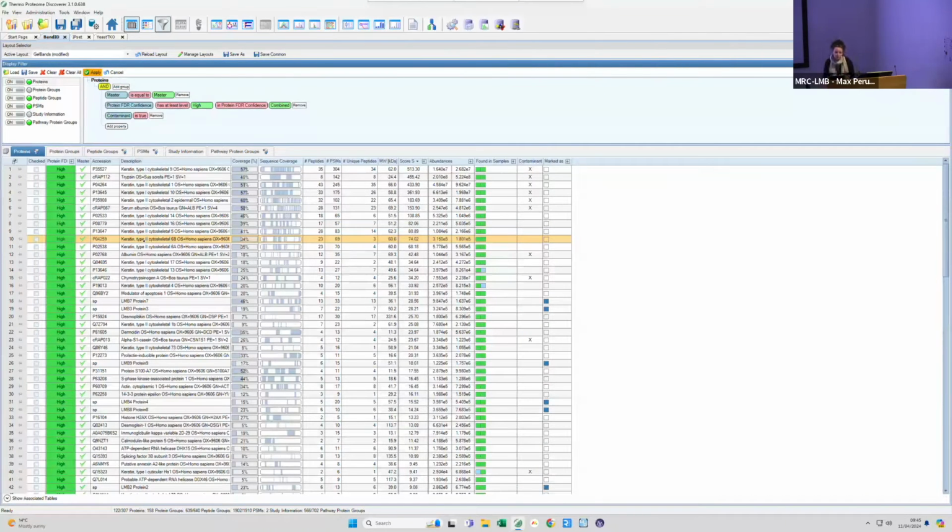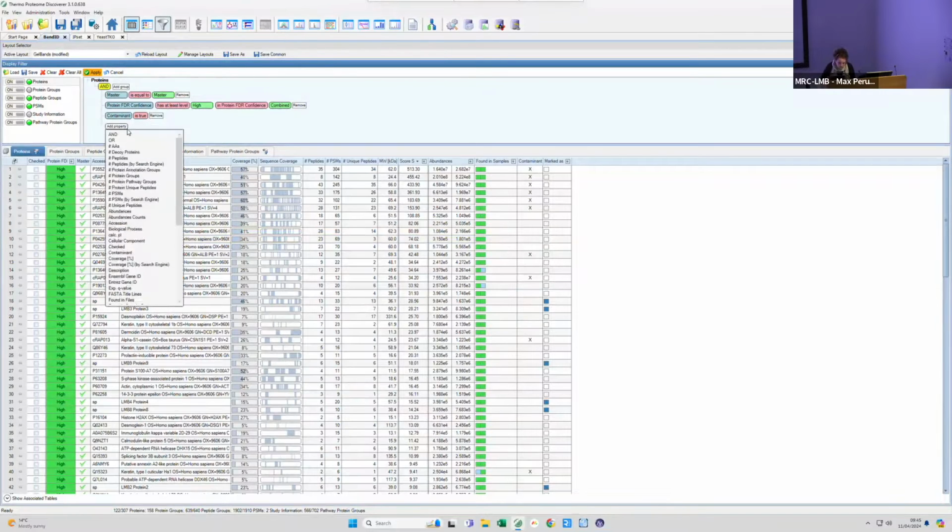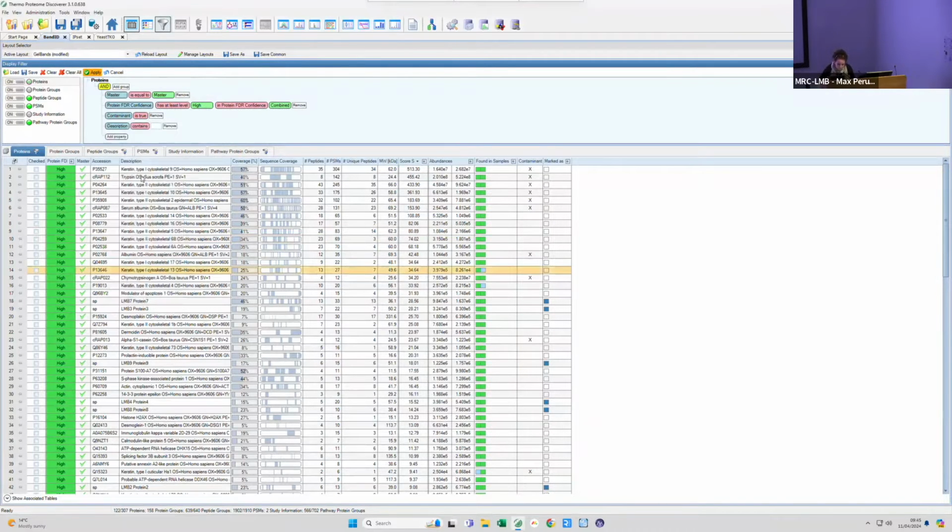The only recommendation that we have to limit keratin is to try to use everything new or very well washed recipients when you're cutting your gel bands. Make sure that they don't have any dust, but it's very common to see keratin in gels because you have to handle the sample quite a lot. So you can filter off contaminants, but I know for sure that there are some keratins that are going to escape this rule. So what we can create is a description filter where we say the description does not contain keratin.